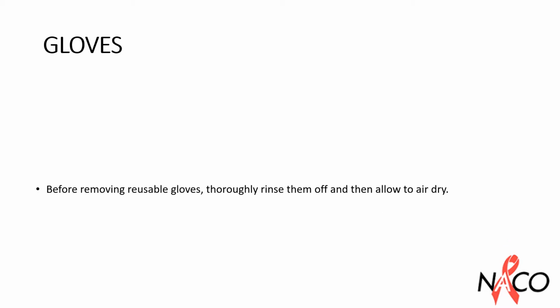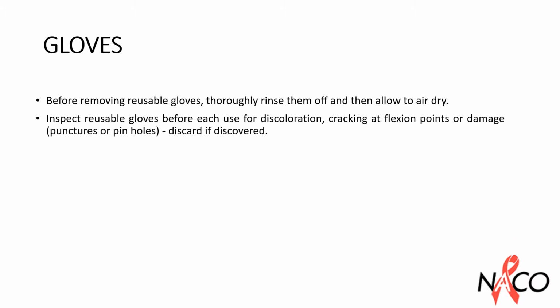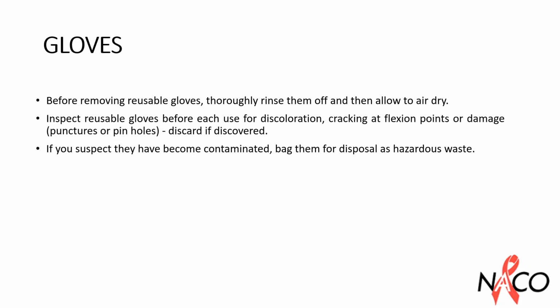Before removing reusable gloves, thoroughly rinse them off and then allow them to dry. Inspect reusable gloves before each use for discoloration, cracking at flexion points, or damage. Discard if discovered. If you suspect they have become contaminated, bag them for disposal as hazardous waste.